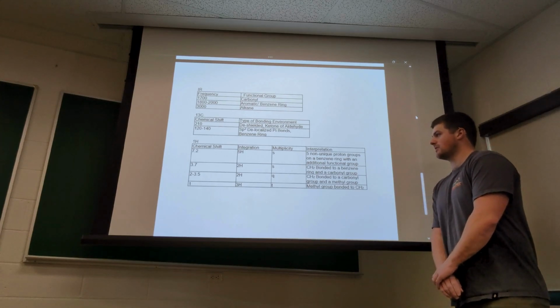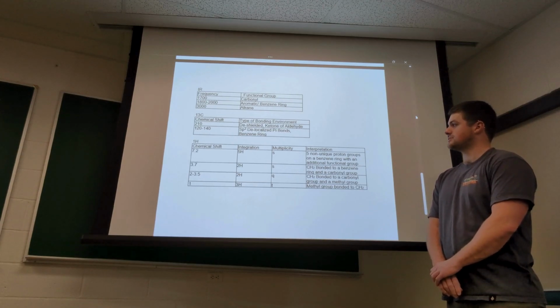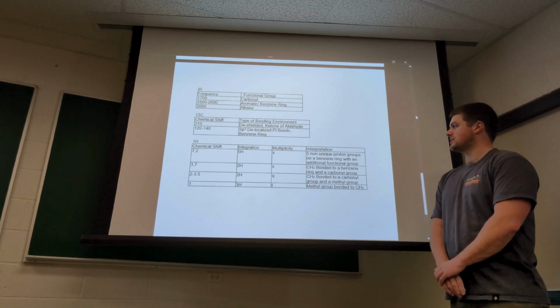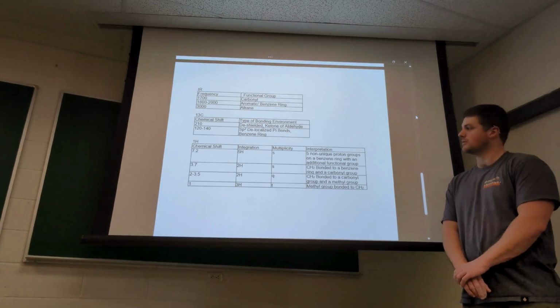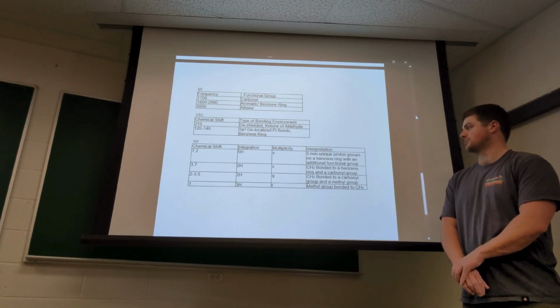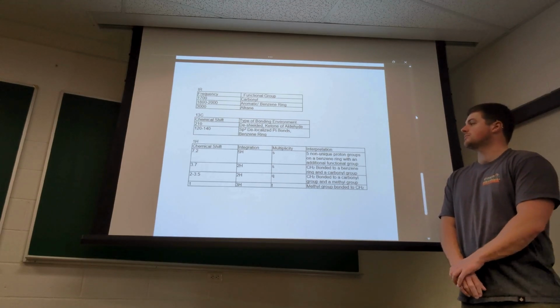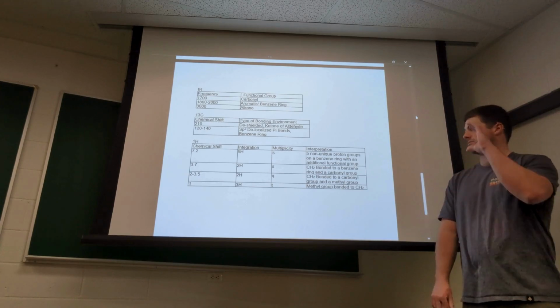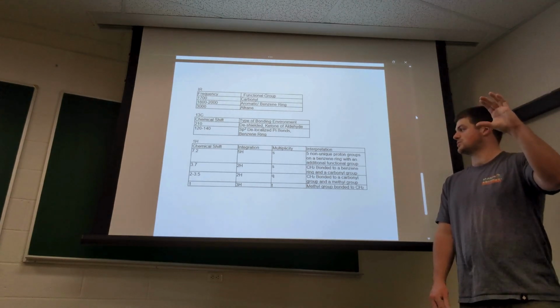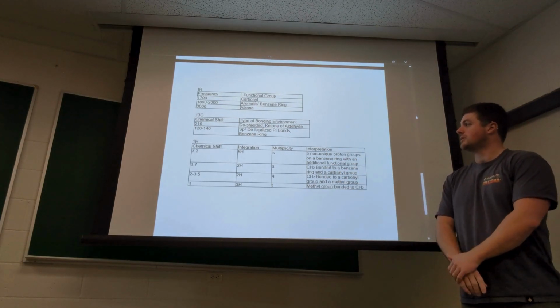And in the proton NMR, at chemical shift of 7.2, we see 5 hydrogens with a singlet multiplicity, which would indicate 5 non-unique proton groups like on a benzene ring with an additional functional group attached. Otherwise, it would be 6H. At 3.7, we see 2 hydrogens with a multiplicity of singlet, which would indicate that there could be a carbon with 2 hydrogens between a benzene ring and a carbonyl group, as we saw up above.